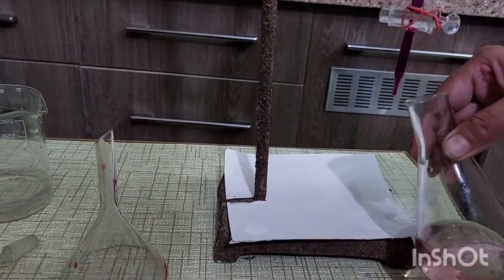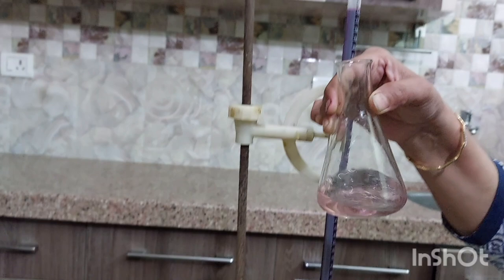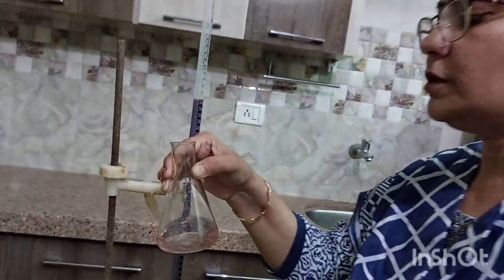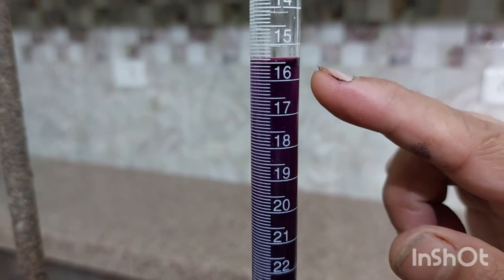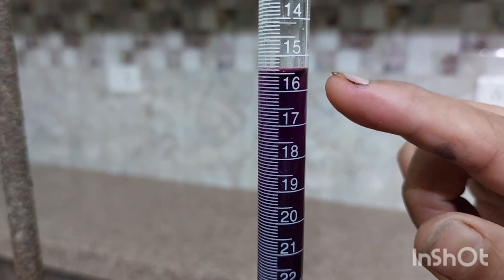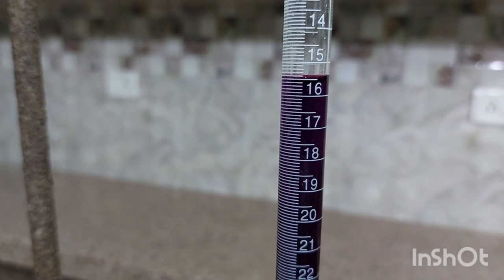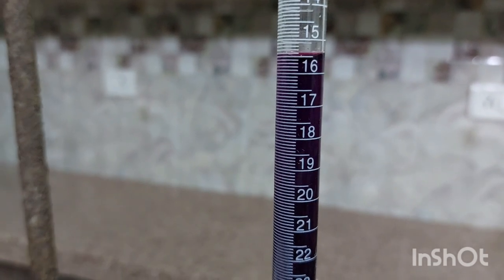Now this transparent color has changed into pink color. This is the end point of this titration. Note the reading. This is 15.7. Repeat the procedure at least 2 times more until you get the matching readings.